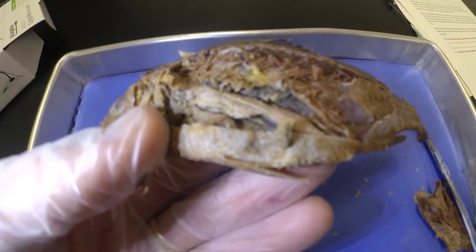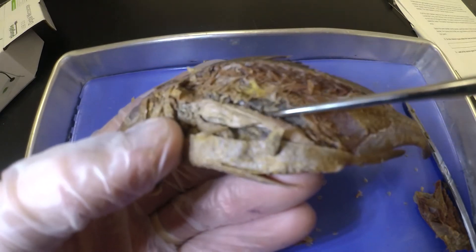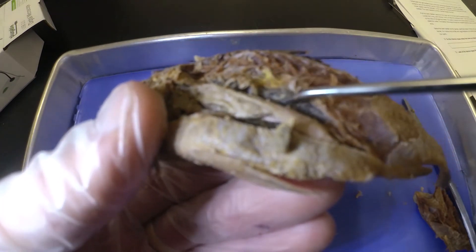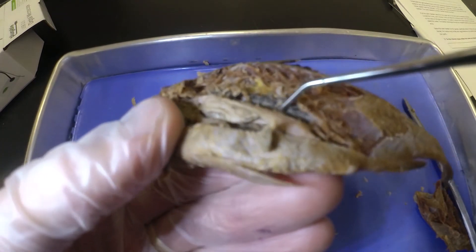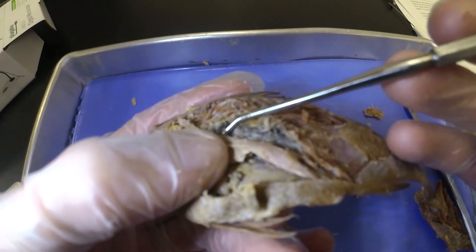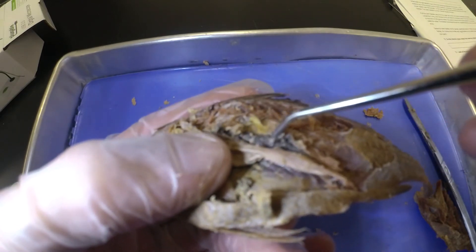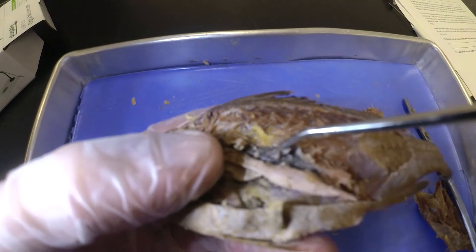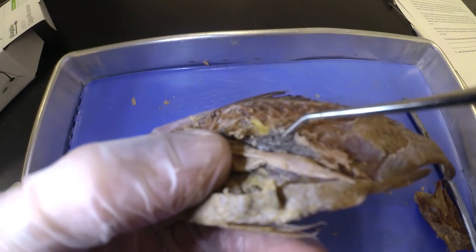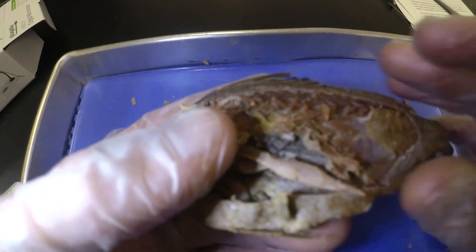Next we're going to look at the swim bladder. The swim bladder is very elastic and allows the fish to move up and down in the water column. Above it you can see a very well-developed kidney — that kidney has lots of branches, lots of tubing, and it's very long, proceeding almost the length of this fish's body. That makes sense in a freshwater fish — it produces a lot of waste, so you'd expect a very well-developed kidney. The kidney is used to process and filter the waste.